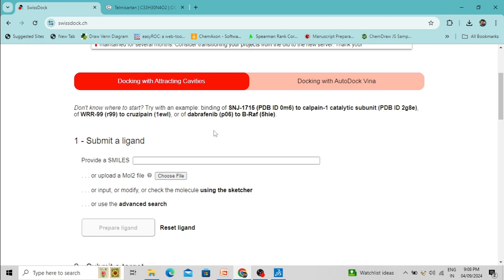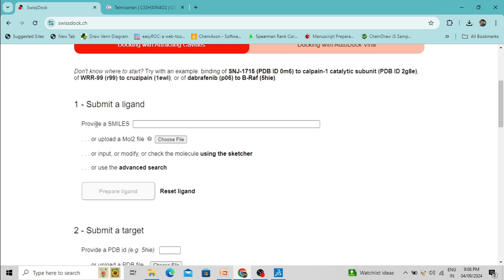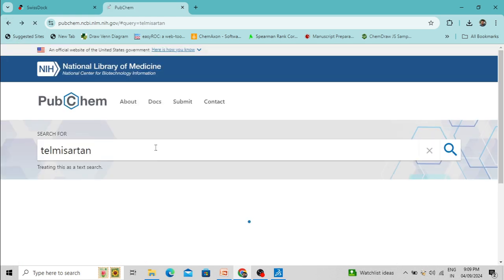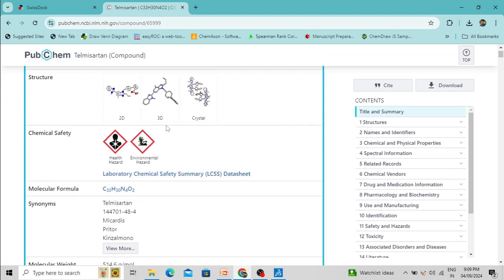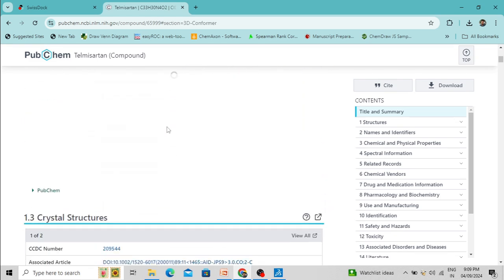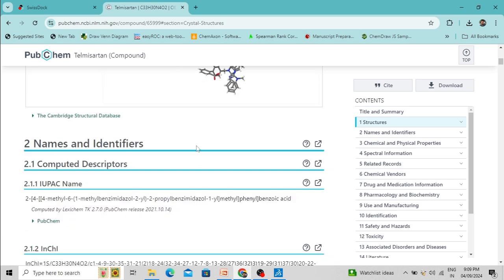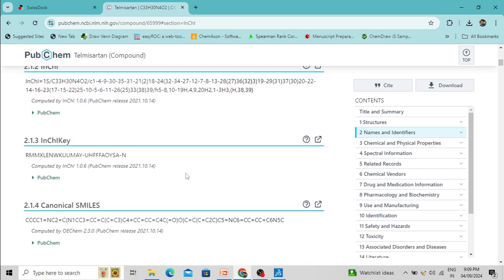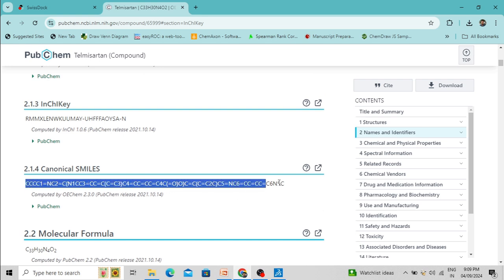First, let's upload the ligand molecule. For the ligand molecule you have to provide a SMILES string. You can get the SMILES format from the PubChem database — for example, I have selected Telmisartan. If you type any drug name like Telmisartan in PubChem, you can get the SMILES format. You can also draw the structure in different sketching software. Copy the SMILES and paste it here.